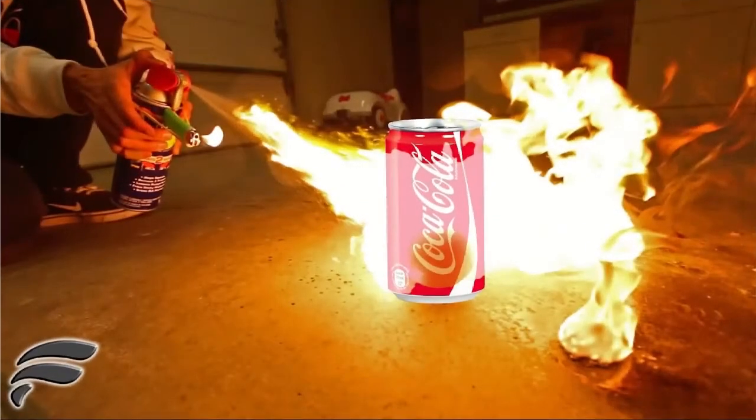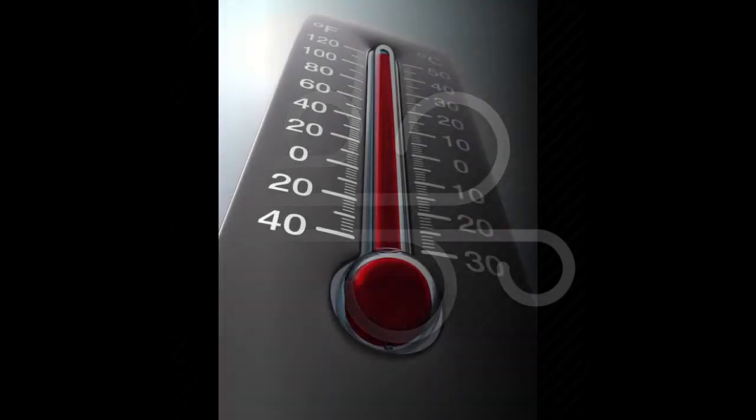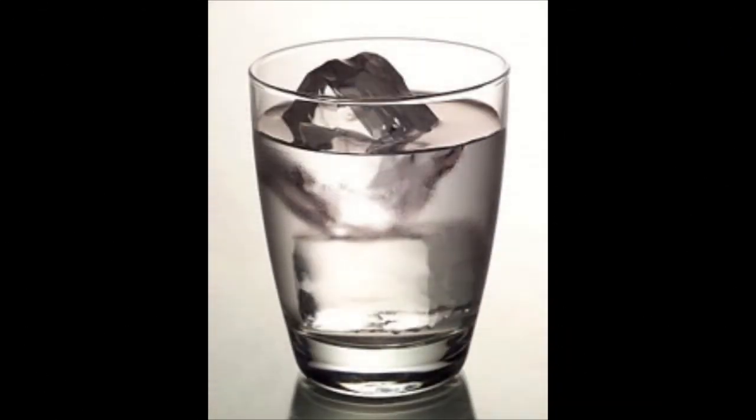Possible errors would have been the place the flame was in contact with the can. This can be solved by placing the flame on a designated spot on the base and protected from any outside forces such as a breeze. Another possible error would be the temperature rising after the first food product was burned. The water may have started from a higher temperature than its original temperature. A solution to this would be to let the water cool down to its original temperature.